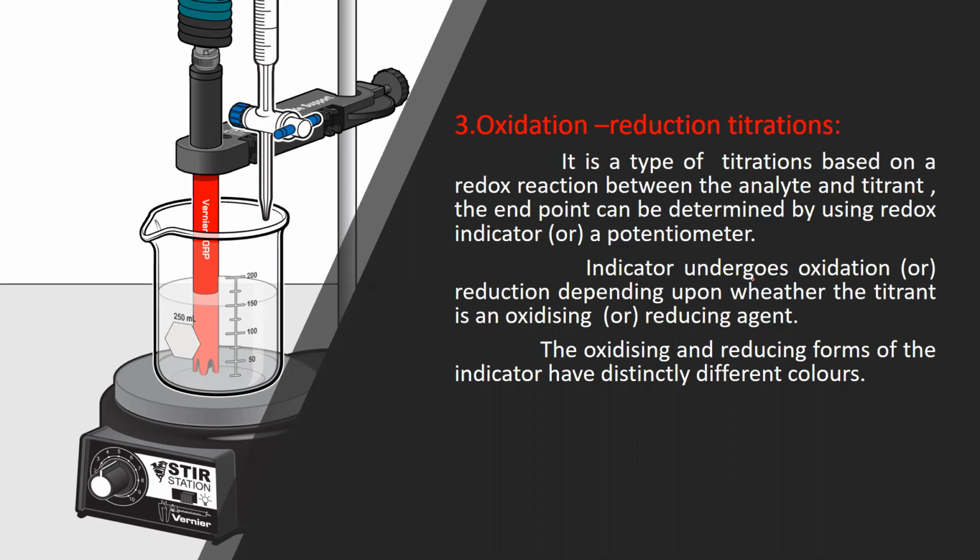The indicator undergoes oxidation or reduction depending upon whether the titrant is an oxidizing or reducing agent. The oxidizing and reducing forms of the indicator have distinctly different colors.